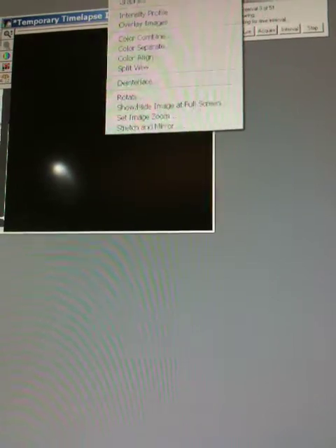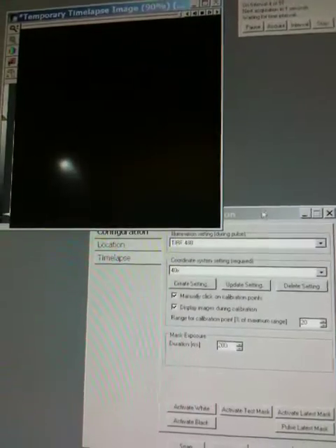During the acquisition, I can say Mosaic targeted illumination. I'm going to draw my new region. Looks like it's actually on right now. We'll update our latest mask, and the system responds instantaneously. It's like we got off an area there we didn't want to be.